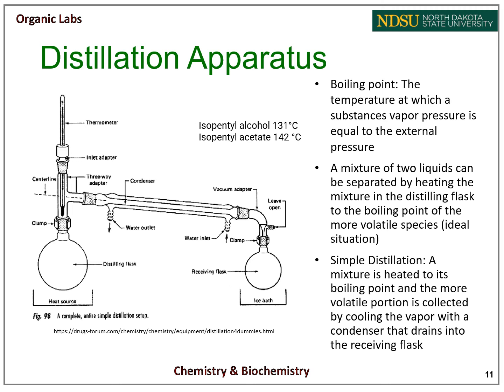For distillations, you'll need a small round bottom to distill from, which will be your distilling flask. And that is to be clamped above a heating mantle. This will then be attached to a distillation adapter that you will have a thermometer attached to. This will monitor the temperature. This all should be connected to the condenser.